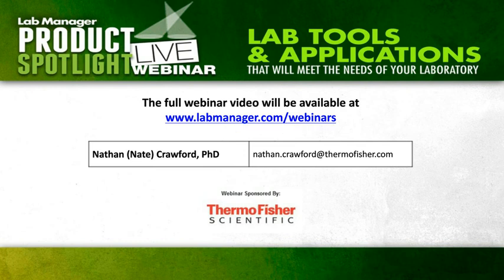Excellent, thank you. Now our next question asks, I have a low viscosity material that I test using concentric cylinders. Do you have any suggestions to improve the cleaning process? Yeah, that's one of the biggest challenges with concentric cylinders. They can be quite a bear to clean, especially with certain materials that are quite thick or sticky.